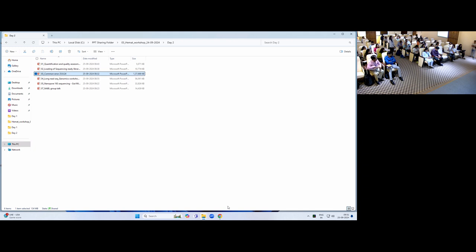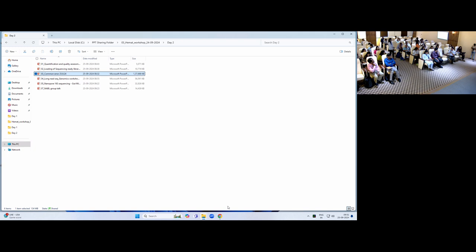This is typically what is a low diversity library. So if you want to offset that, you have to add something which has diverse bases everywhere, so that other signals can be read. This is where PhiX comes into play, because randomly you will get different regions of the genome. So low diversity, typically, will be single amplicon based libraries. Anything else I can think of, maybe 16S, but other than that I can't think of anything.